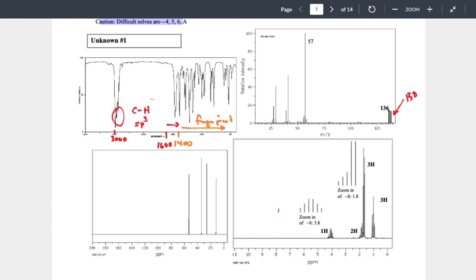99.99% of it is carbon-12, so I don't have to worry about that isotope effect. What we do have to worry about is ultimately 2 different elements, bromine and chlorine. Bromine has 2 common isotopes, bromine 79 and bromine 81, oddly enough separated by 2. So when we're looking for the M+2, we're trying to identify, do I have bromine?